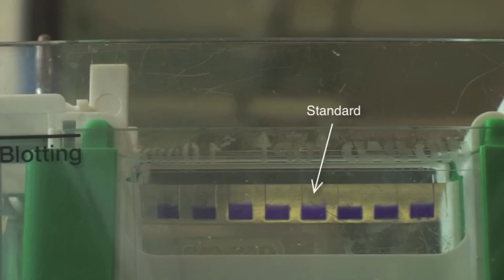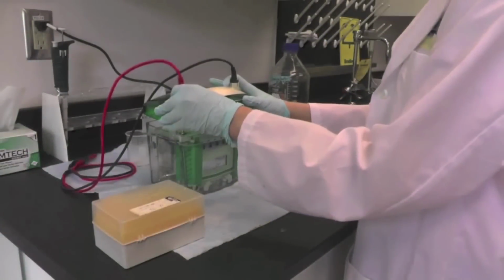For the molecular weight marker, you also need to load 10 microliters into the well, and it should be loaded in one of the center lanes for easy comparison.